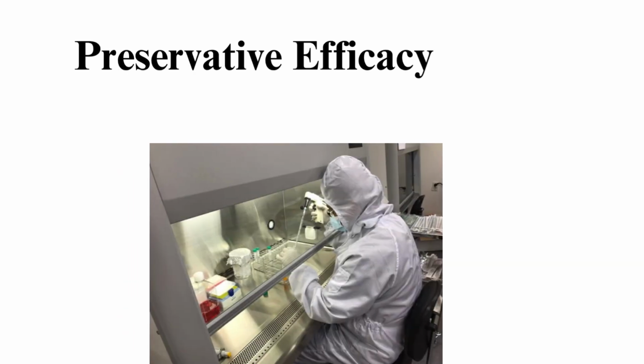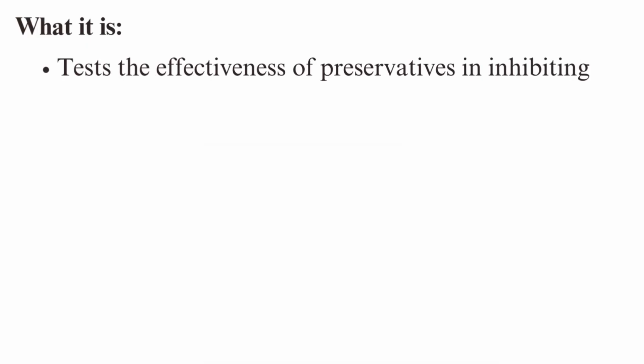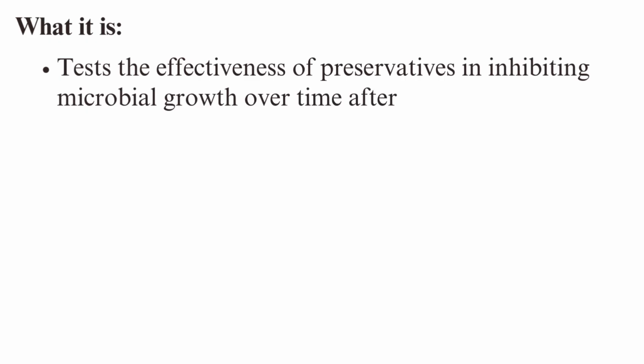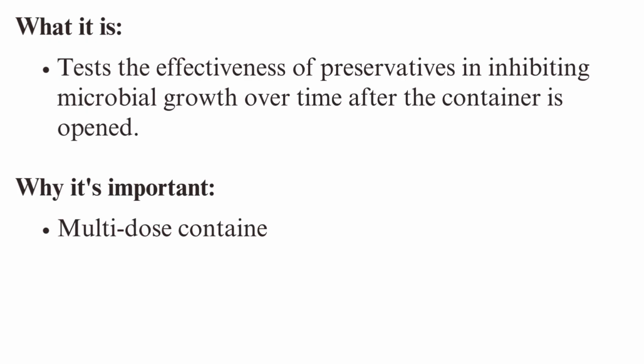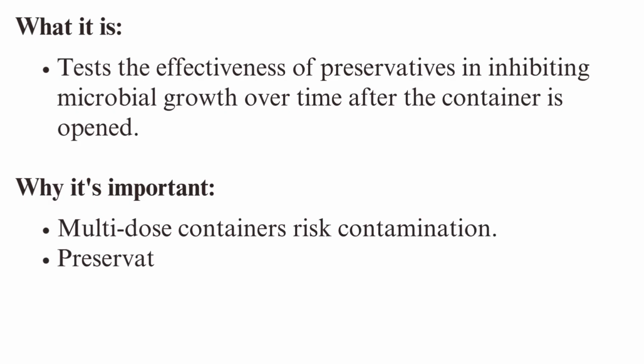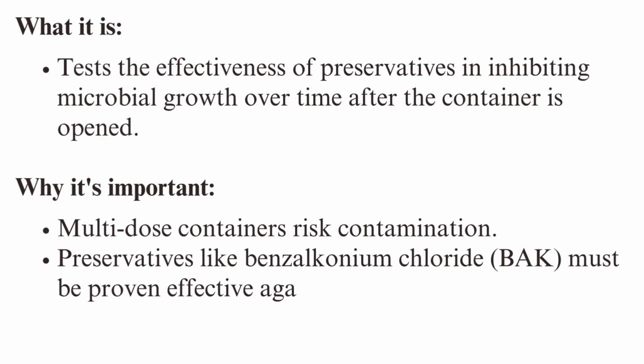7. Preservative efficacy test. What it is: tests the effectiveness of preservatives in inhibiting microbial growth over time after the container is opened. Why it's important: multi-dose containers risk contamination. Preservatives like benzalkonium chloride must be proven effective against microbial threats.